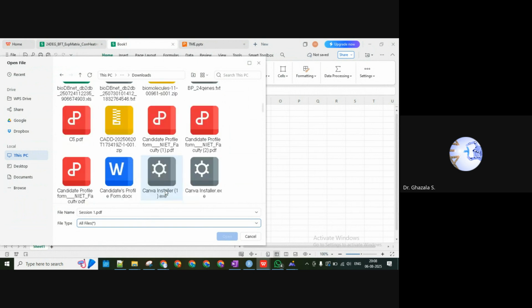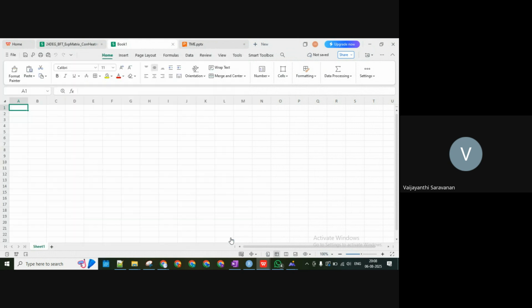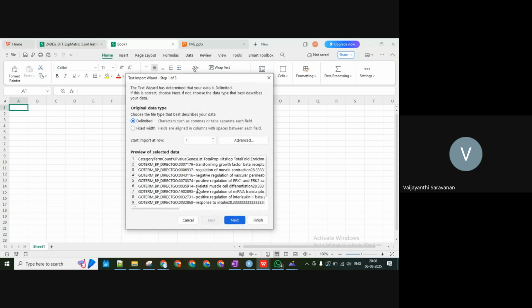Then I can write the paper accordingly, like the differential expression of the known genes may affect the expression of the unknown. I guess only with this we can report these things. Yes, ma'am. For next class, I'd like to go for the primer designing for the 24 genes.